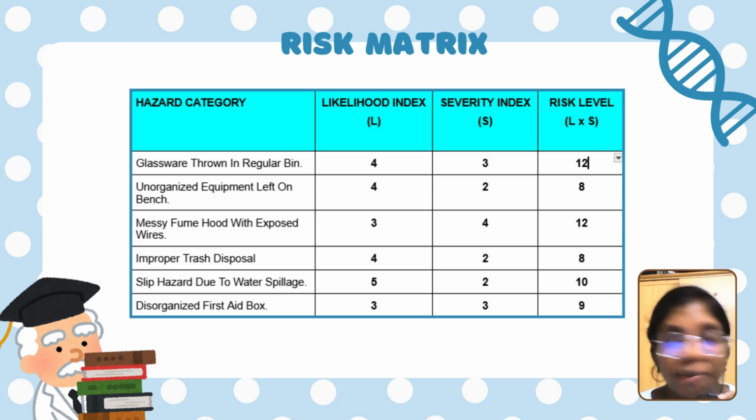Based on the table on this slide, the first one is glassware thrown in the regular bin.